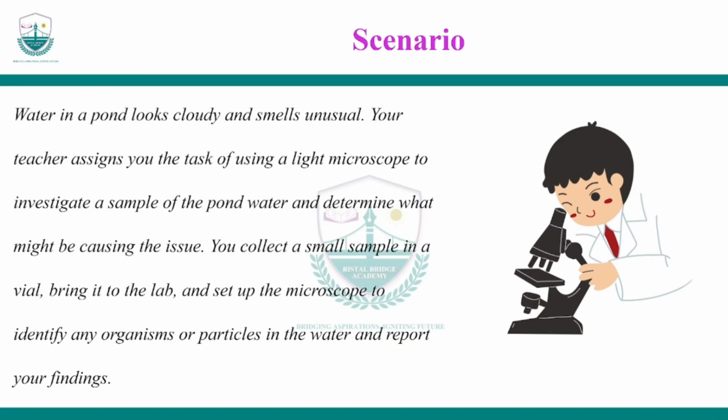Let's start by looking at a scenario where water in a pond looks cloudy and smells unusual. Your teacher assigns you the task of using a light microscope to investigate a sample of the pond water and determine what might be causing the issue.